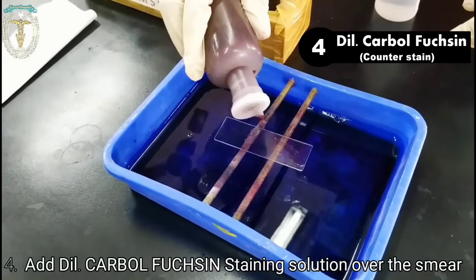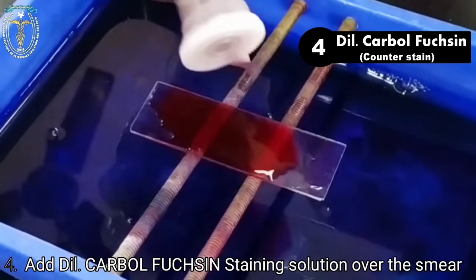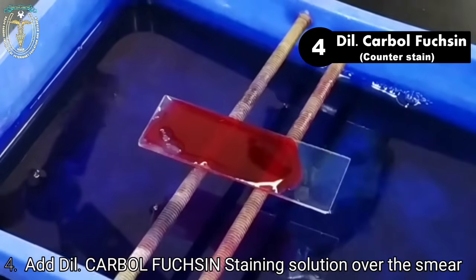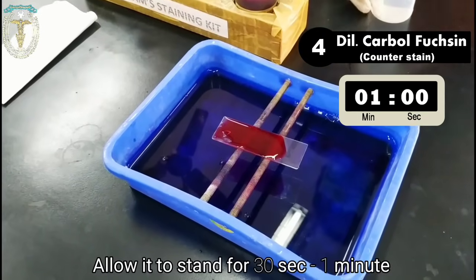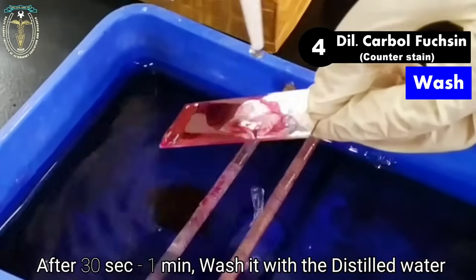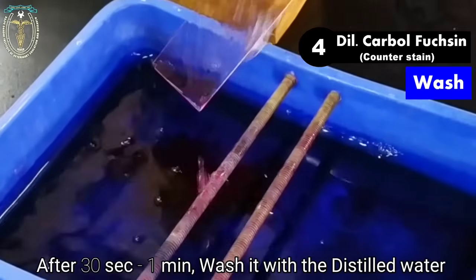Lastly, add the dilute carbolfuchsin staining solution over the smear. Cover the entire smear with the staining solution and allow it to stand for 30 seconds to 1 minute. After 30 seconds to 1 minute, wash it with the distilled water.